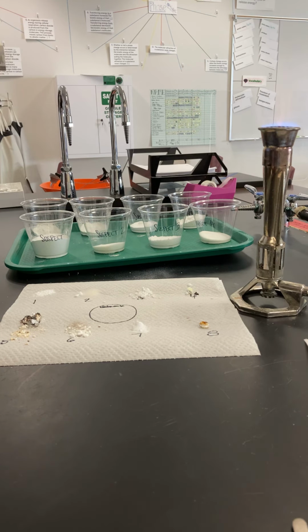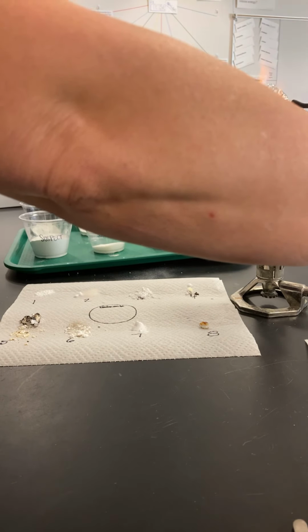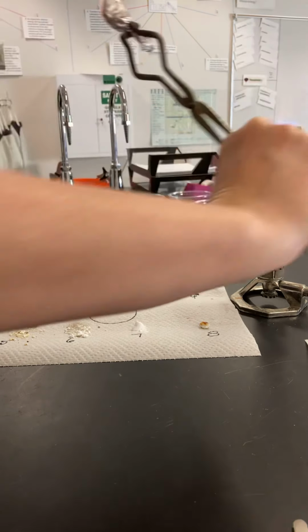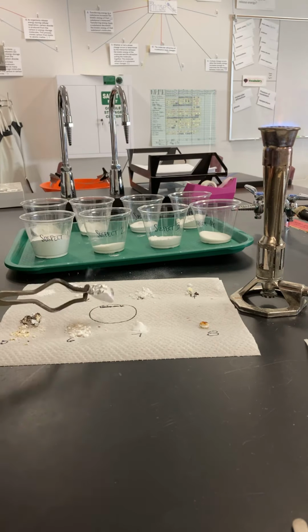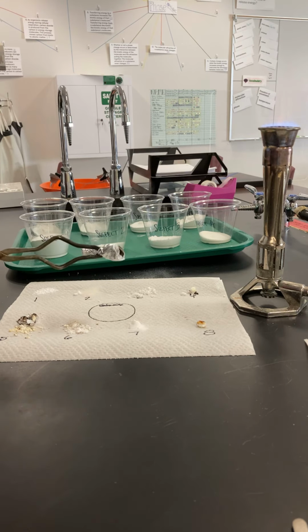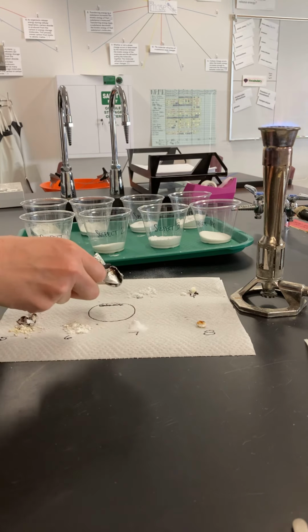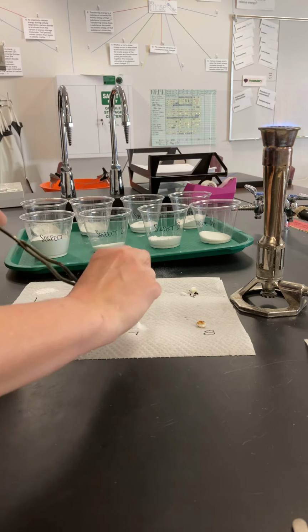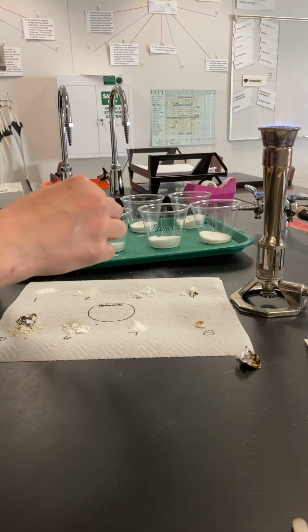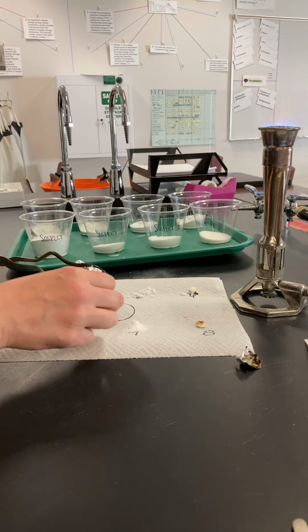Okay, and then this last one's going to be our unknown, and then I'll let you guys take a look and see how it looked after they burned. So again, 1, 2, 3, 4, 5. That one definitely started melting. Notice it started on fire. See if I can tap any of that out. Okay, leave some of that behind. Definitely got some almost black tar in here. So that one melted really good.